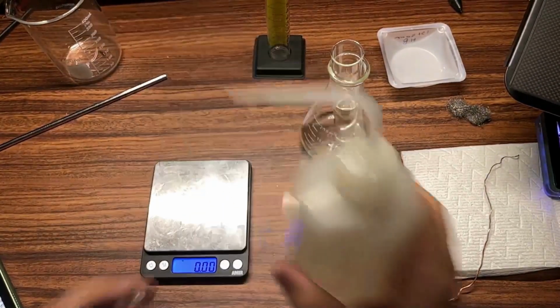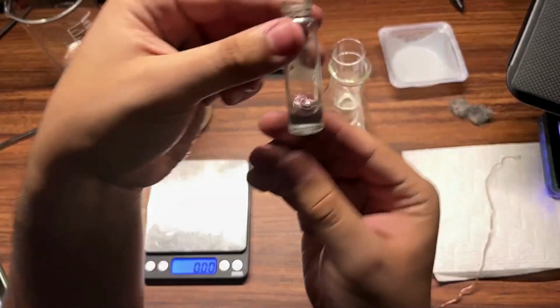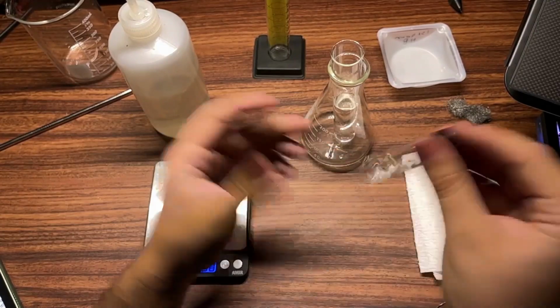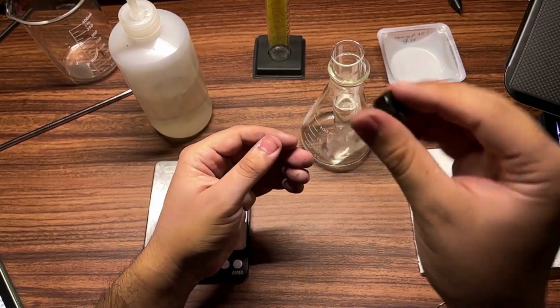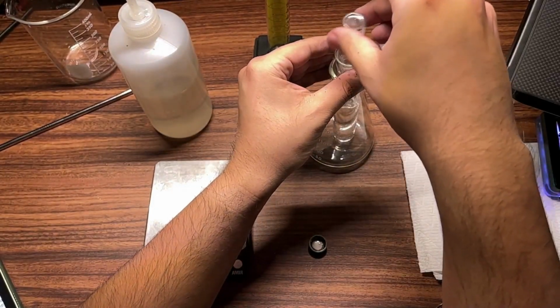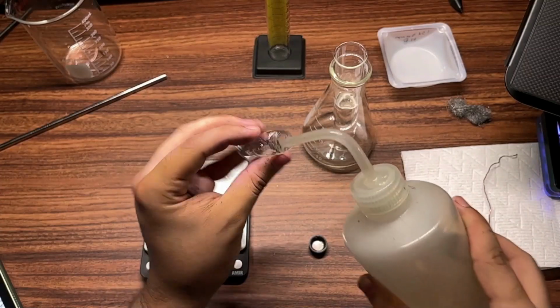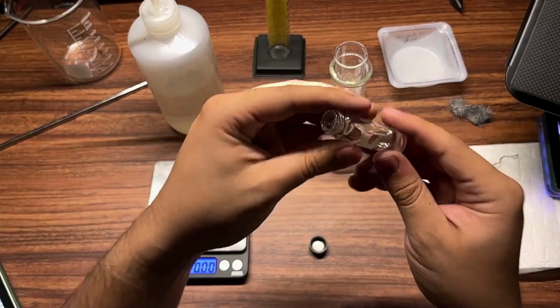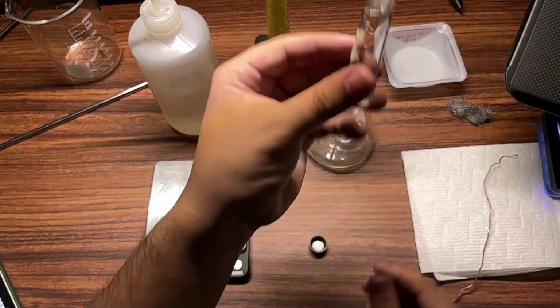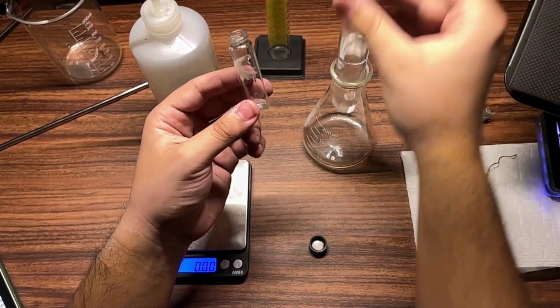Okay, I need to get that silver nitrate out. And to do that, I'm going to rinse it with a little bit of water. Right now, the silver nitrate that was left in here, I want it to dissolve in this water, actually. And then I can add that water to my test tube. Okay. Let me do one more rinse, because now there's dissolved silver nitrate in the leftover water, you know what I mean? So I'm rinsing it out. That should have gotten all the silver nitrate out. Now every little bit of silver nitrate that was in my vial to begin with, now it's all dissolved in this water here in my test tube, which is good. That's what I want.